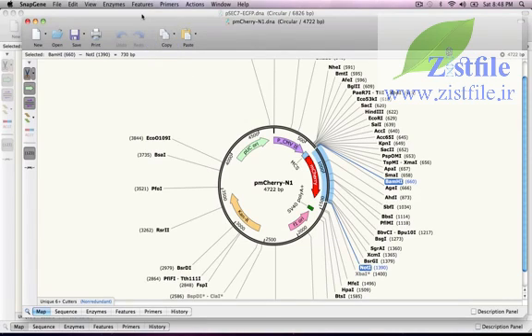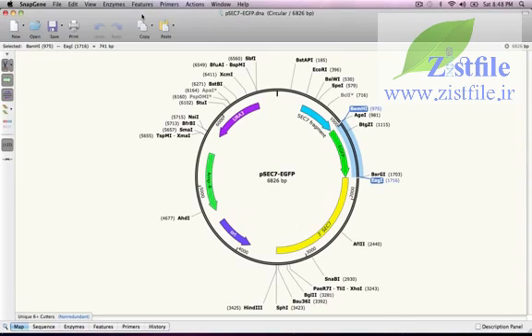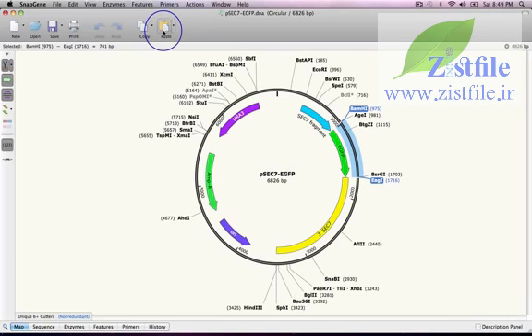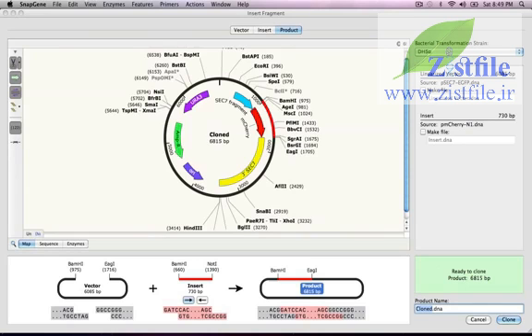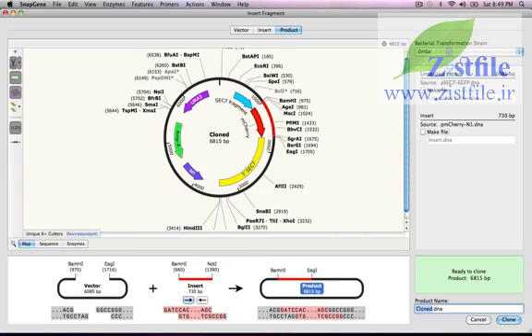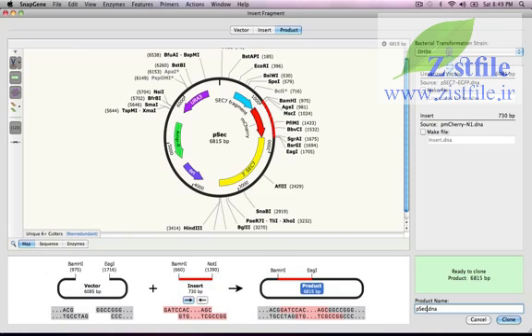Now I'll switch to the PSEC-7 EGFP window. The BAM-H1-EAG1 fragment that I want to replace is still selected, so I'll replace it by pressing the Paste button. That copy-paste operation automatically opened the Insert Fragment window and populated it with the fragments I want to clone. All I need to do is type the name of the product, PSEC-7M-Cherry, and press Return, and I have my cloned product just as before.